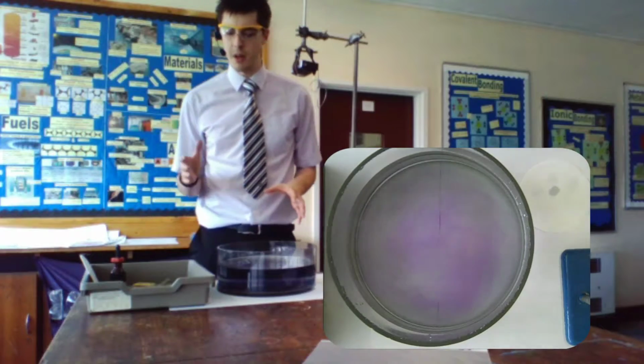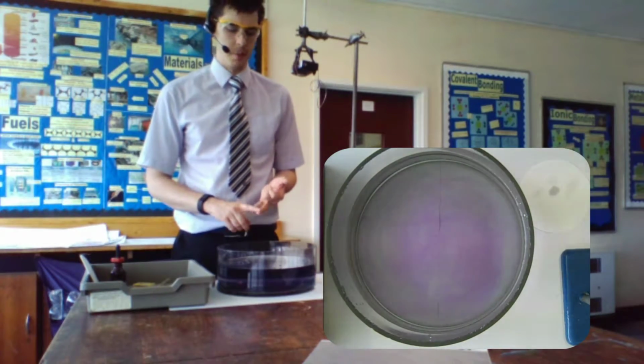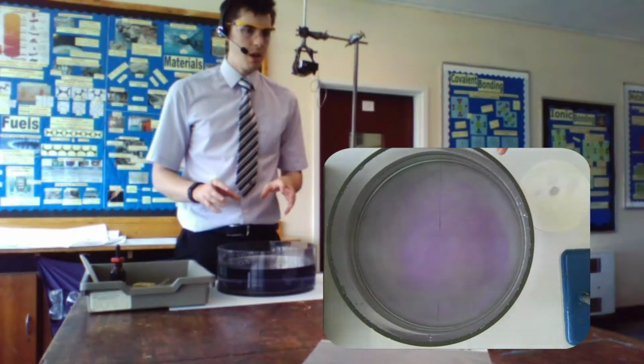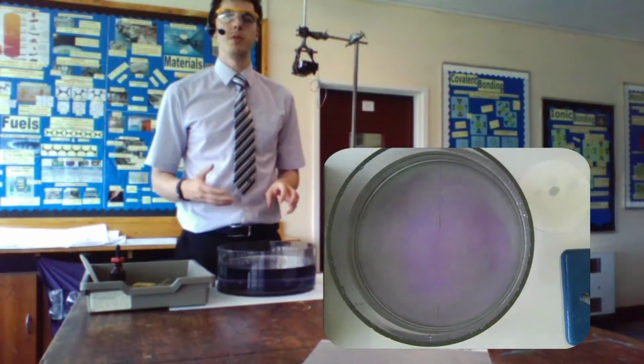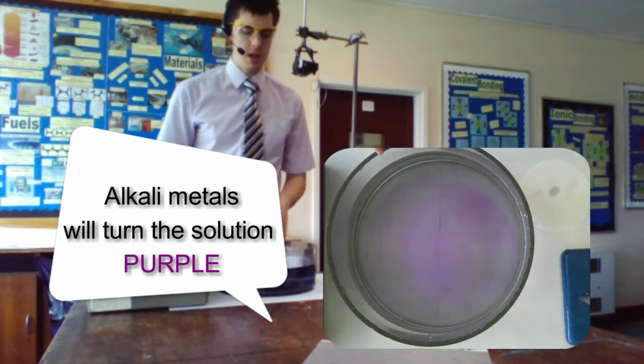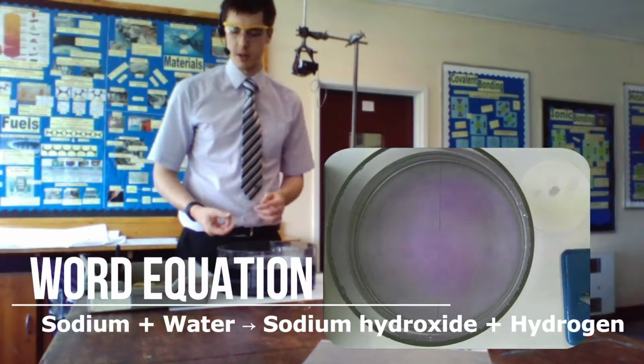Okay, so what we've seen so far, we've put our alkali metal into the water. They've both floated around on the top. Sodium has moved around a bit faster and given off a bit more gas. In this reaction, what we're doing is we're producing an alkali. You can see the colour has gone purple. So we've produced lithium hydroxide and then sodium hydroxide.